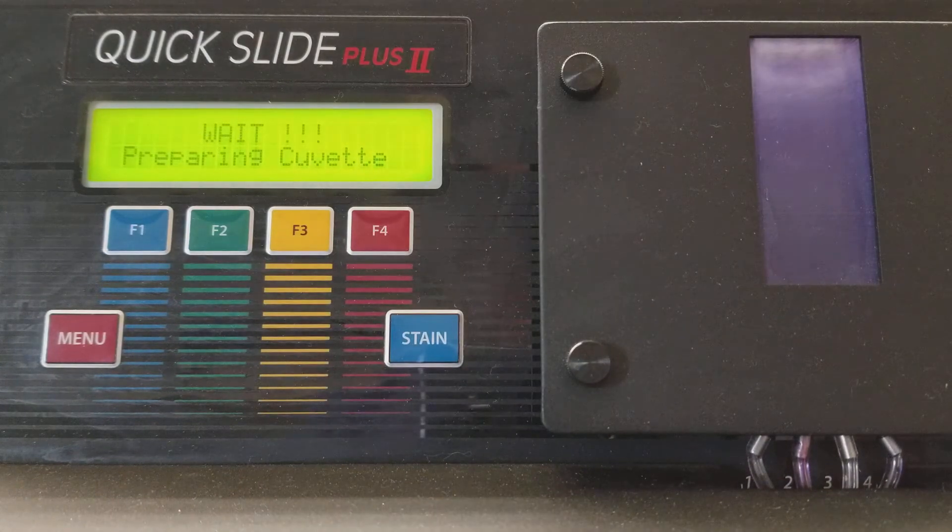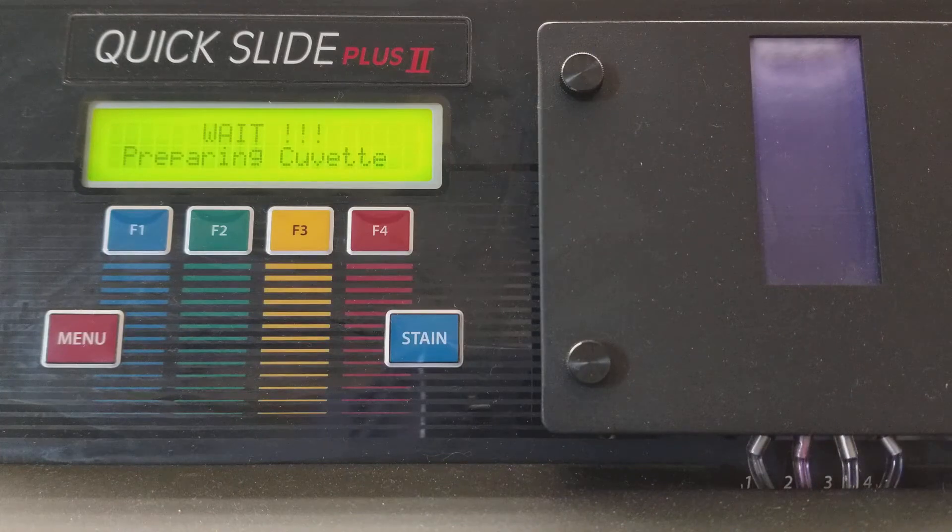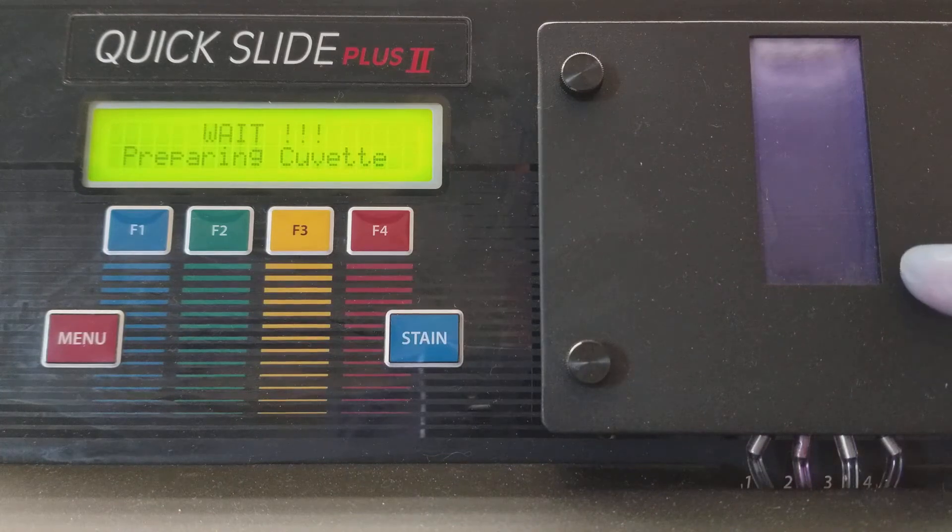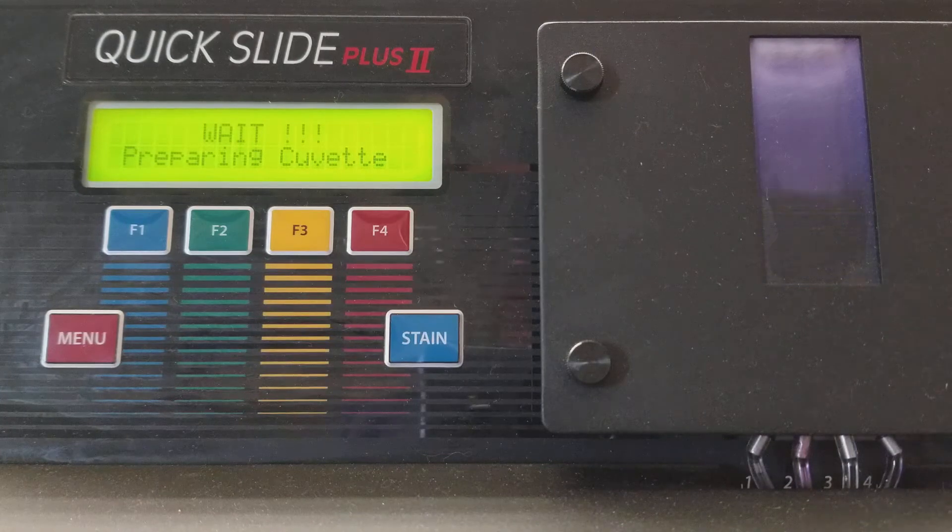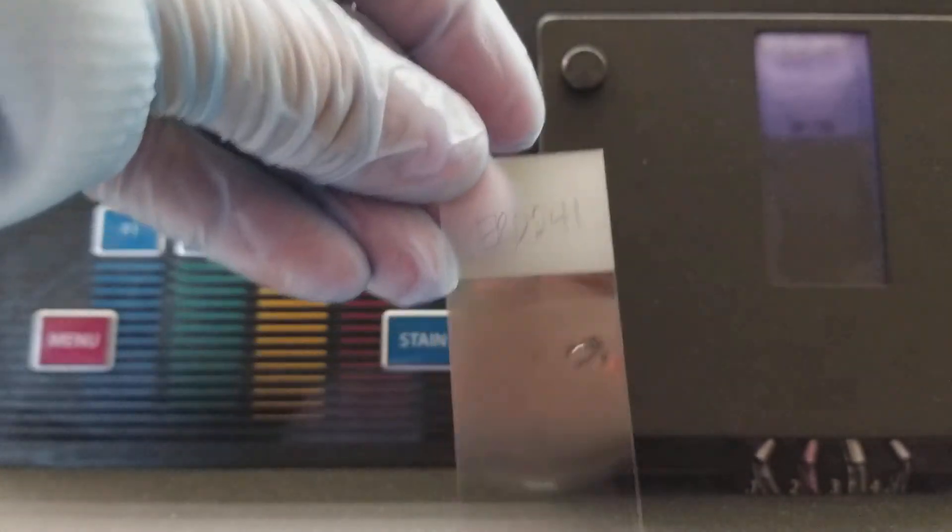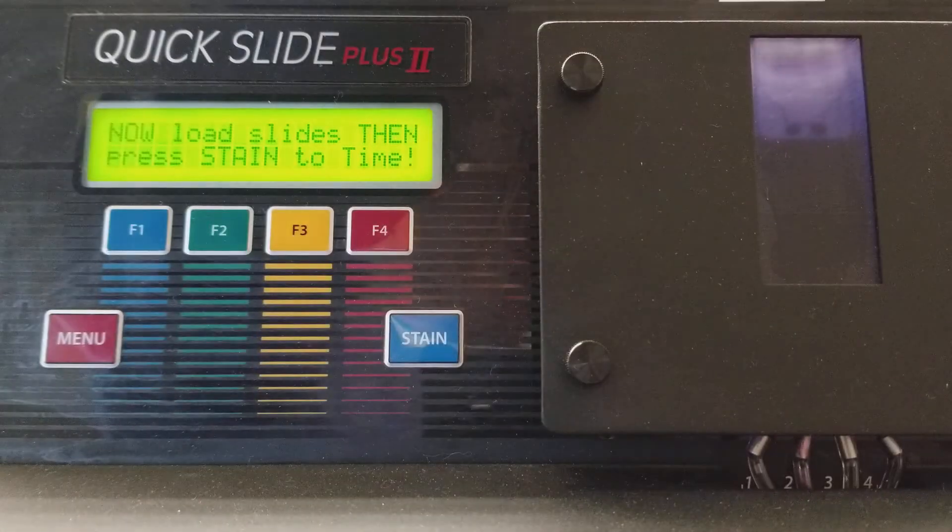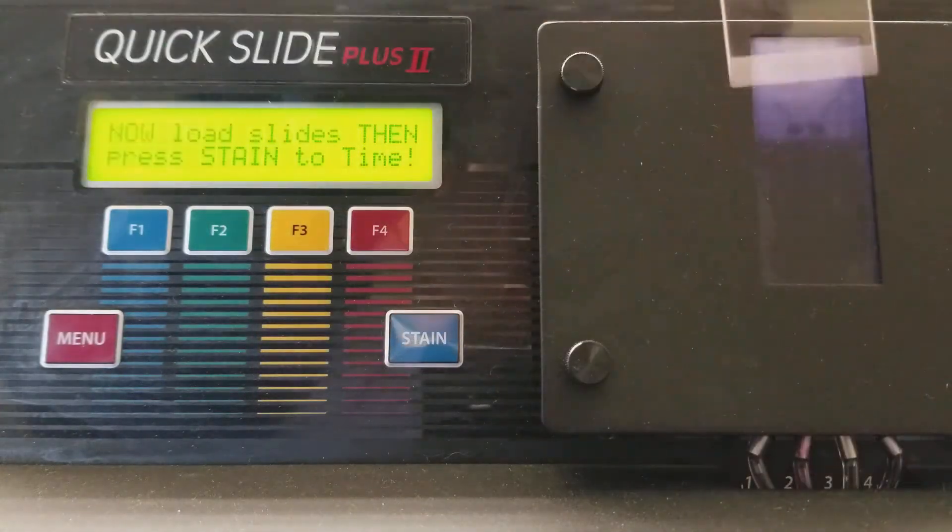So we have to wait, obviously. It's preparing the cuvette. It's going to add some stain in there and when you put the slide in there, you want to make sure to place it so that the frosted edge is facing you.